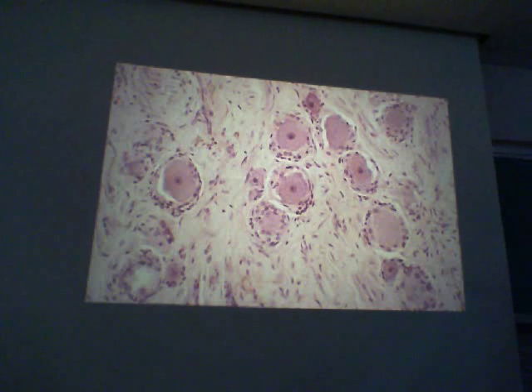So this is from what sort of organ or structure? Okay. Ganglion. Spinal ganglion. And how about this structure we see right there? Node of Ranvier. Or as they say out in Alliance, Ranvier.